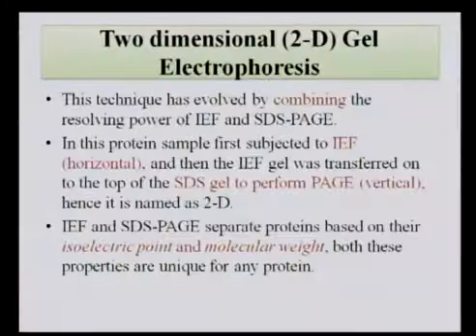Let us explore more about 2-dimensional electrophoresis. As we said, IEF is the horizontal one, whereas SDS PAGE is the vertical mode. That's why by combining the horizontal and vertical, otherwise IEF and SDS PAGE, this technique is known as 2-dimensional electrophoresis.